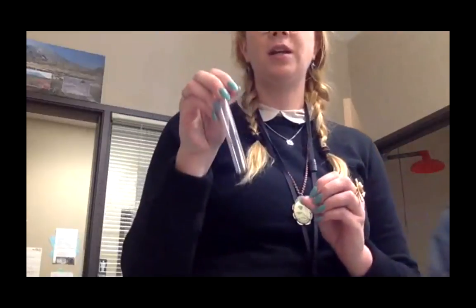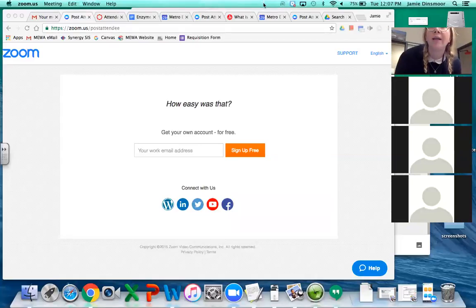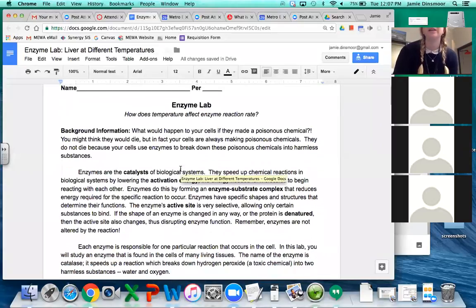But basically what we're gonna be doing is we're gonna be taking our chicken liver, putting it in test tubes, and heating it to different temperatures to talk about enzymes. So I'm gonna go ahead and share my screen here for those of us tuning in from home, and those of us who are here. If you have your lab printed, you're gonna wanna be looking at it. If you don't, you're gonna listen.